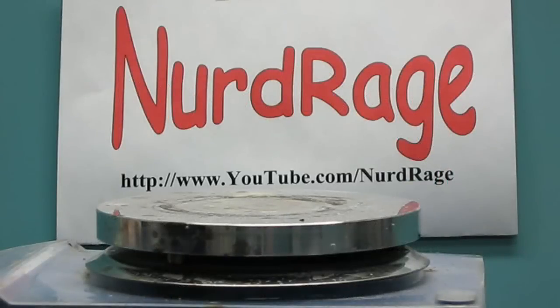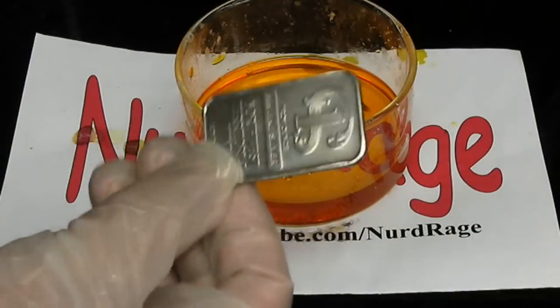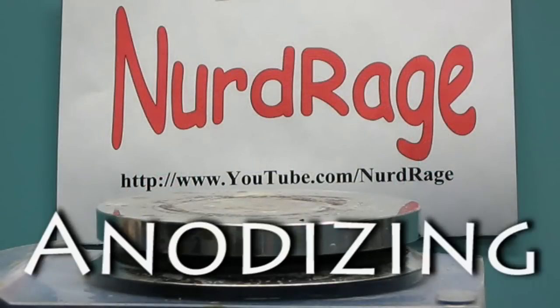Greetings fellow nerds. In this video we're going to use electrochemistry to add brilliant color to this otherwise bland and colorless silver bar, without using any paint. This process is called anodizing.